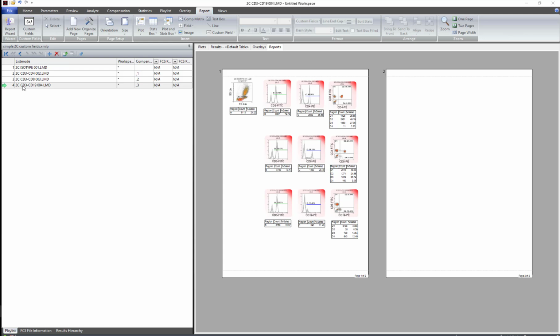We can also do a lymphosum, which enables us to add various components together and check the validity of our results. We can then add an interpretation to say whether the calculation or the result is within range or out of range, to flag on the report if an abnormal result or if a problem has occurred. Custom fields are created from regions and FCS information embedded within the file.